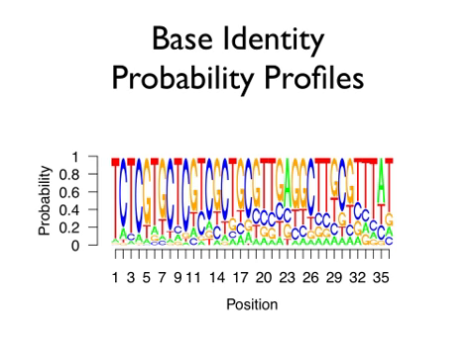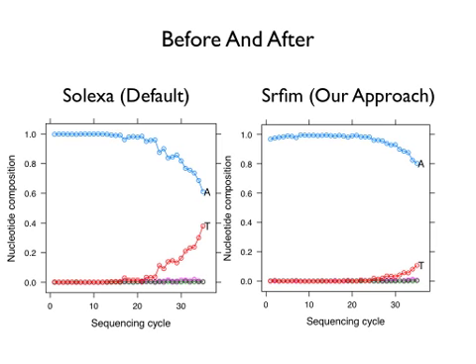So what you get from this, if you were to use this, is instead of getting a G call, you say, well, G is most likely, but T is almost as likely. And that would serve like as a quality call. So if you use that to make these calls, you get rid of this problem, kind of.